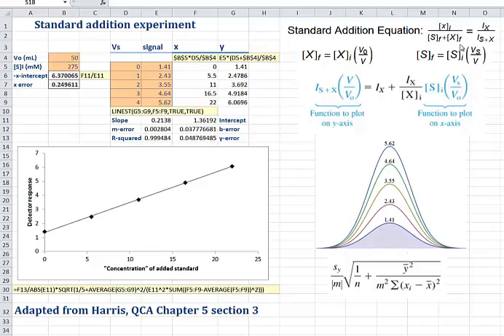One thing we need to take into consideration with standard addition is that when you add a little aliquot of a standard to a solution, you're changing the volume. So the tricky part is calculating the actual concentrations because the volume is always changing. There are ways to set up this experiment where the volume effectively doesn't change, but since we're interested in making precise and accurate measurements in this class, we're going to use a more rigorous analysis.